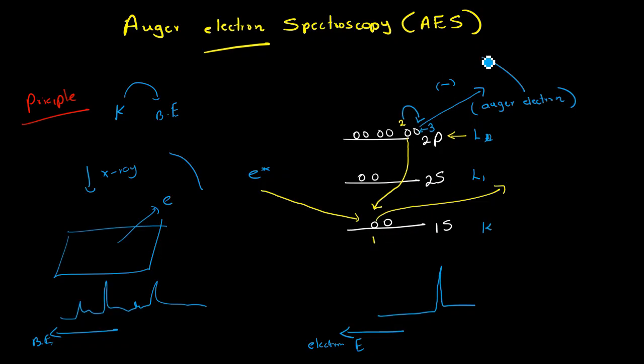So the instrument can catch this electron with low energy, right? It has also spent some energy on the positively charged surface. So this is the original peak we have. But if we have a positively charged surface, then you will have relatively lower energy.